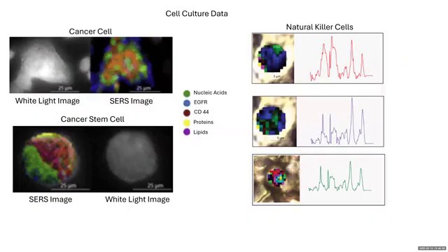I'm also exploring the advanced imaging modality where we perform SERS imaging and also use data from individual spectra. So this is the next project, and we will use SERS imaging and a multimodal machine learning approach for early detection of cancer. Machine learning will help us with discovery of unexpected biomarkers with potential for therapeutic intervention. And for this, we are also in the process of developing a lab-on-a-chip platform for simplifying sample handling and standardization of sample storage so that this research can be translated from lab to the market.